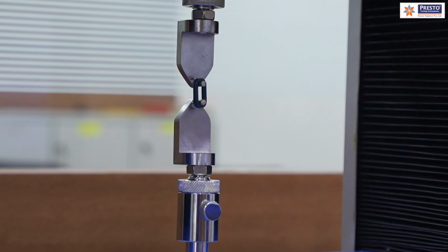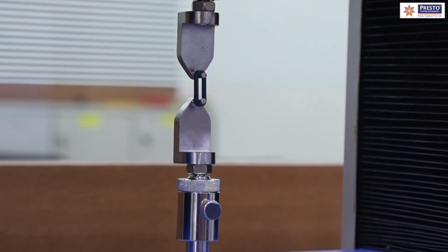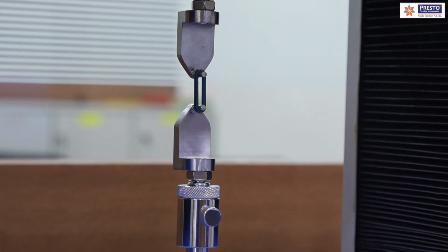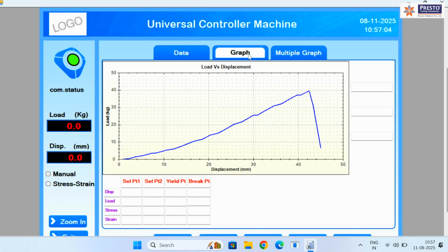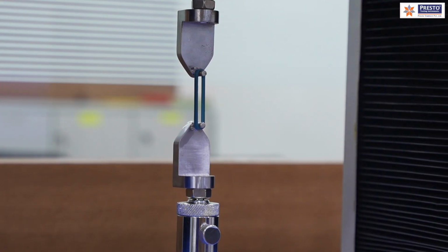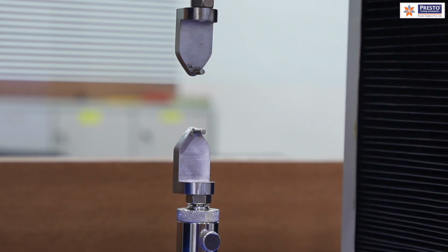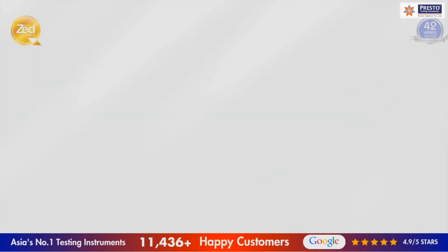Generally, the peak load and break load are what we need to see, and any sample which can bear more than this will be considered a good sample, or as per the standard. You can also see this kind of graph. This is how we can perform the tensile strength testing on O-rings. We have already understood the purpose and the industries which use this. For more such information and testing, you can contact Presto. Thank you so much.